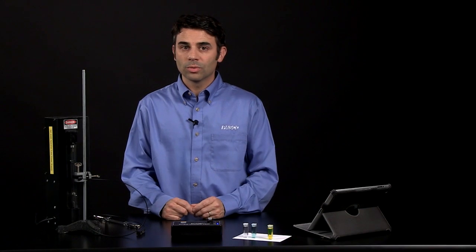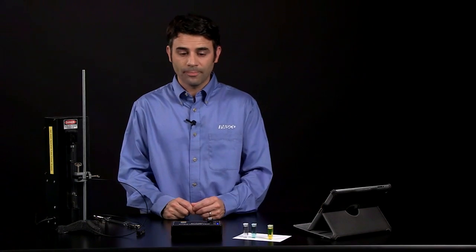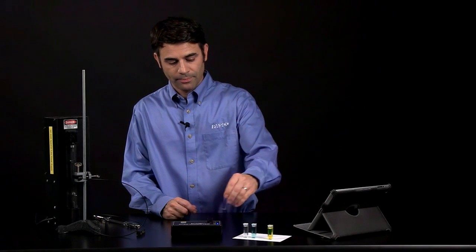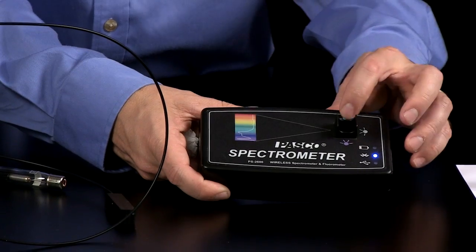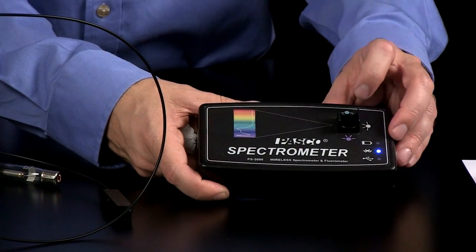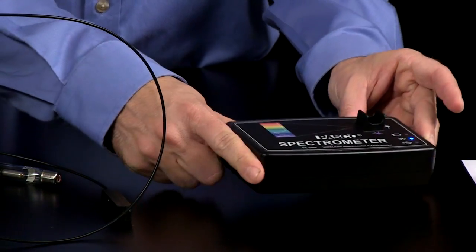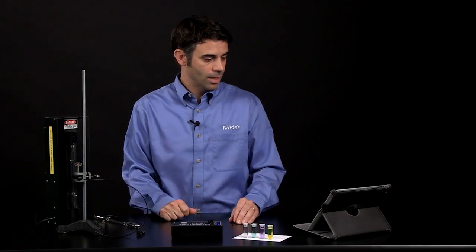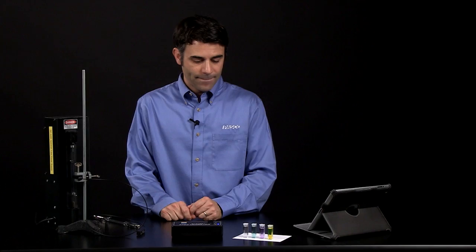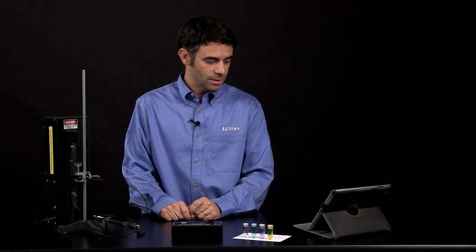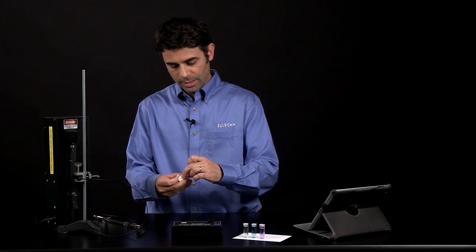Now the other nice thing that you can do with solutions without getting into Beer's Law kinetics is you can do fluorescence very quickly and easily. The spectrometer itself has two LEDs for fluorescence: a 405 nm excitation wavelength and a 500 nm excitation wavelength. So if I go to the fluorescence tab, it will turn on the light in the spectrometer simply by going to the tab. I'm going to put a fluorescing sample in here.